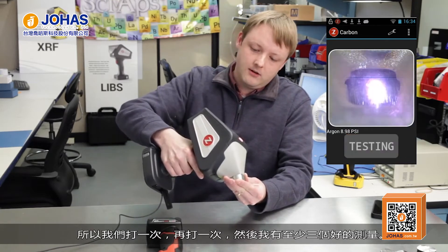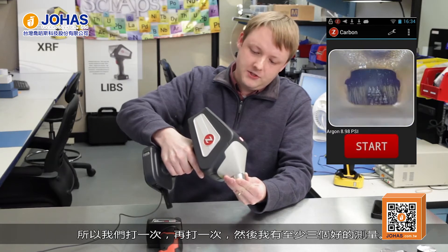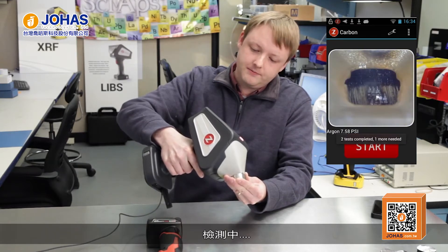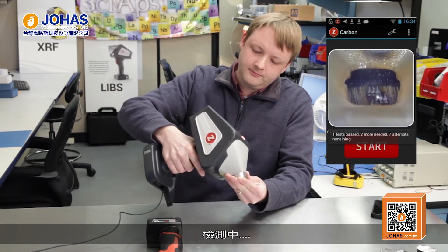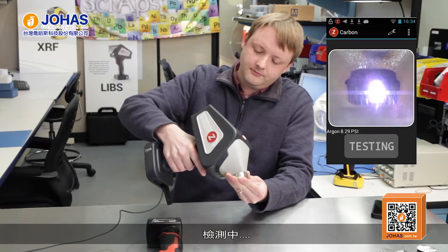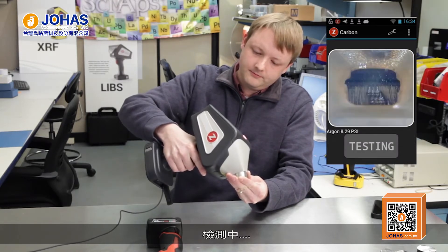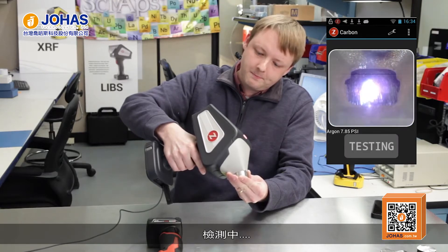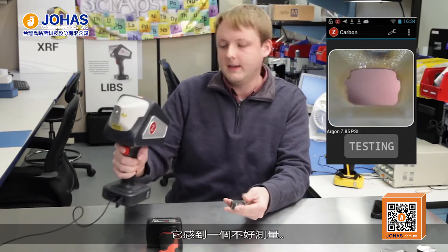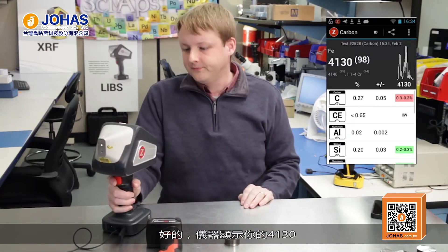When you start a test, the software is going to prompt you to test a certain number of times — that's user settable, but it's usually a minimum of three or five tests. You do have to pull the trigger each time, and we recommend testing a different location each time. The software is going to keep count and it's only going to report a carbon result after you've hit that minimum number of good tests. It's prompting me for one more — it sensed a bad test and rejected it. And there's your 4130.